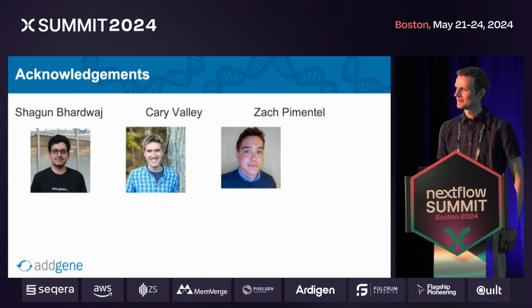There's another question there from Harshal. Would long reads be better than short reads, especially for the assembly?